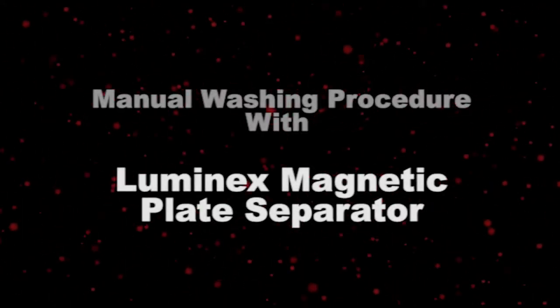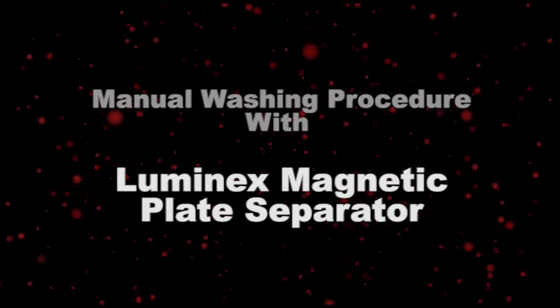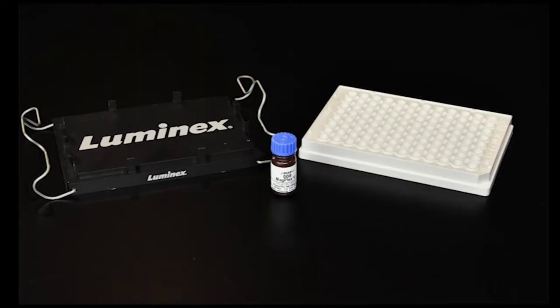Welcome to the Manual Washing Procedure video for MagPlex Microspheres using the Luminex Magnetic Plate Separator. This procedure is used for washing steps with your XMAP assays. When automation is not available, using the Manual Liquid Reagent Evacuation method effectively removes supernatant and unbound analytes.